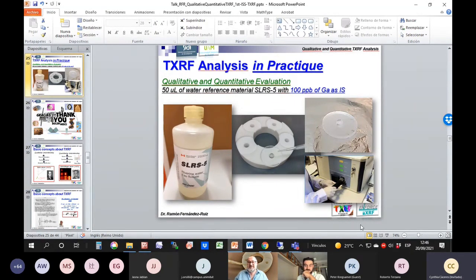it's necessary, it's totally necessary, take care with the deposition. It's a factor very, very important, okay? Because the analytical results obtained by TXRF depend in a great measure of this deposition only. Thank you very much.